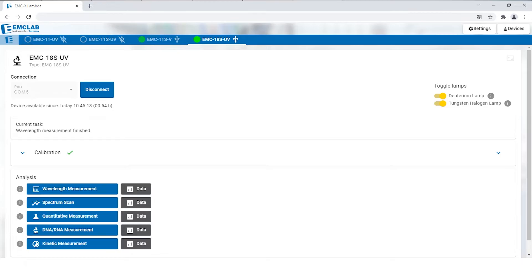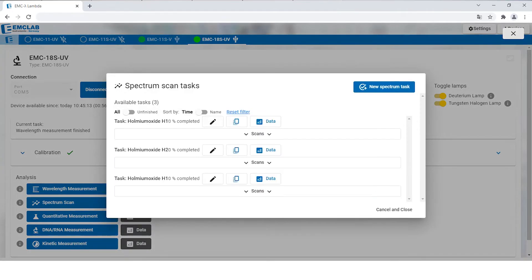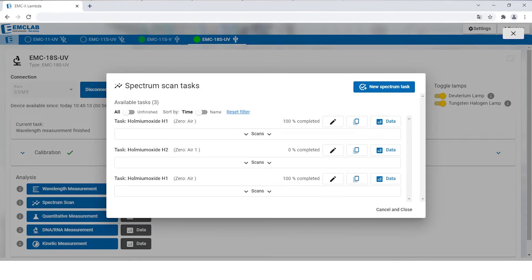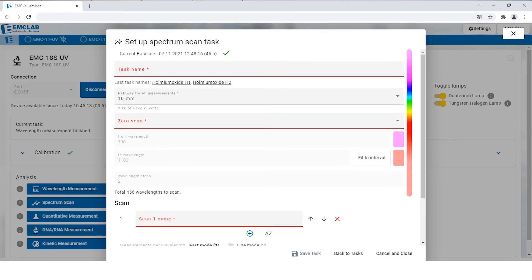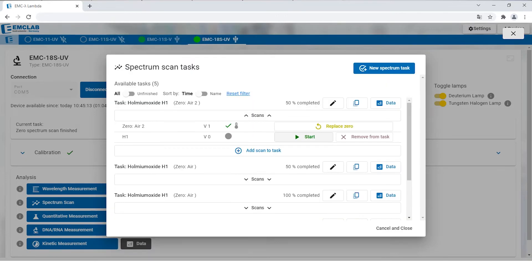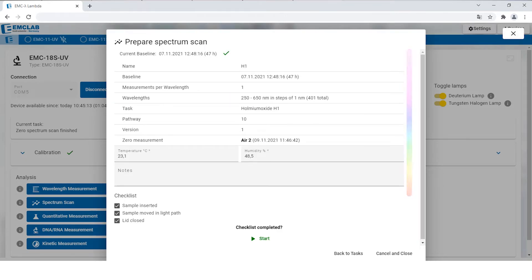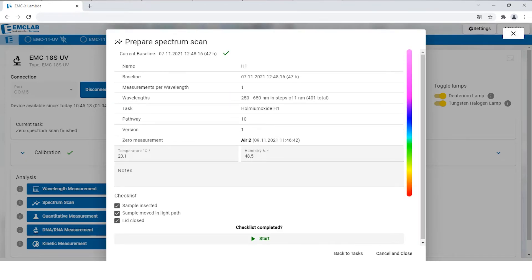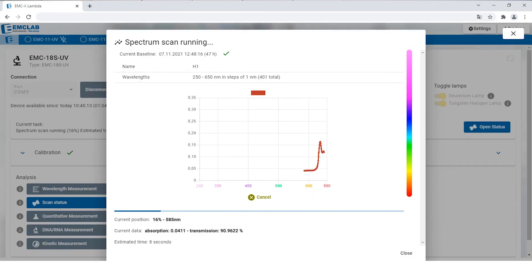Then we will demonstrate the spectrum scan. The principle of the task screen is basically the same. Once you have filled out all the information, you can start the scan and the pop-up window will show a preview of the scan.